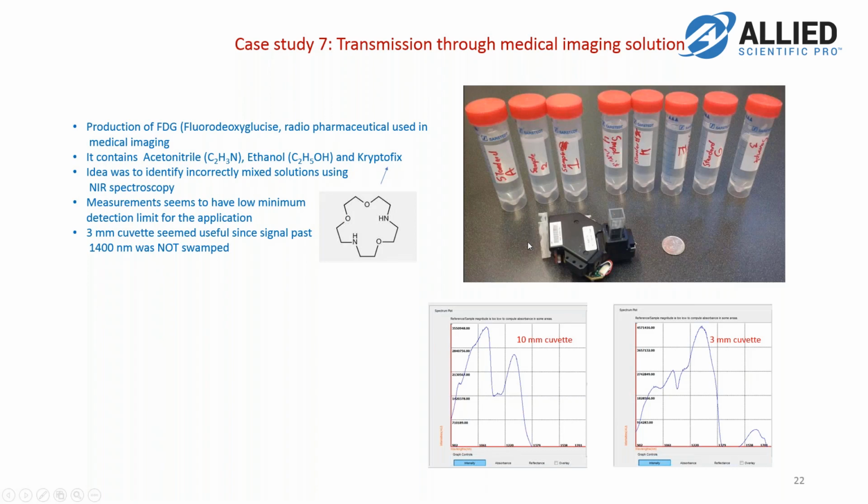As soon as we poured the sample into this and made the measurement, suddenly there is another peak showing past 1400 nanometers that could have useful information. So for water-based solutions, you need to use a 3 millimeter thick cuvette, and 1 centimeter is not good for it.